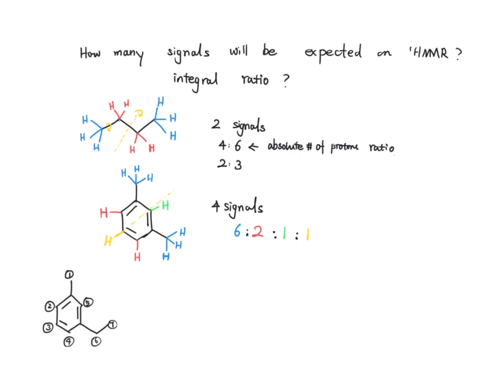And now let's look at proton A, that is for methyl. Methyl has 3 protons that are homotopic protons. So first of all, if I just say 1, 2, 3, 4, 5, 6, 7, this number indicates the protons assigned to these protons. Okay, this is proton 1, and you have 3 of them. So I will say 3 hydrogens.